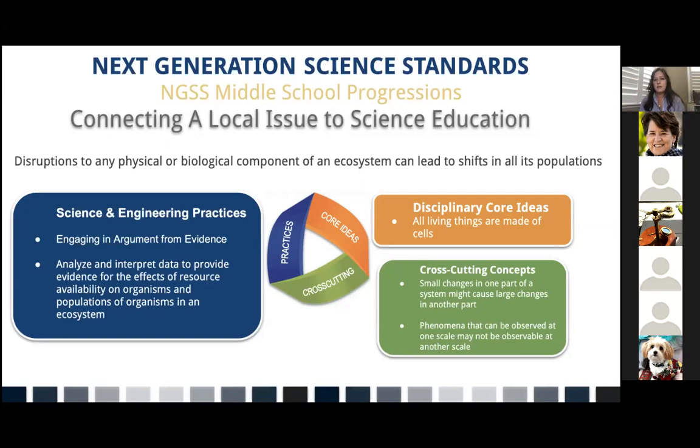And then cross-cutting goes into the concepts that what you see on one scale, you can't necessarily see on another. So I really feel like these are ideas that are challenging for teachers. It's challenging for me: how can I meet these standards? And I feel like using Foldscopes really helps to give concrete things the kids can participate in and engage in.